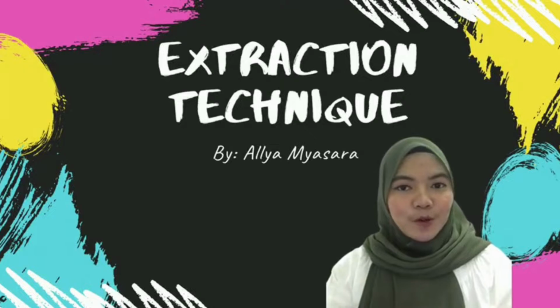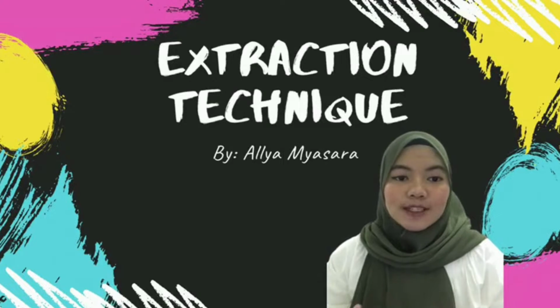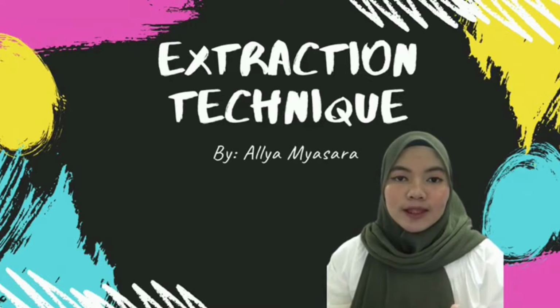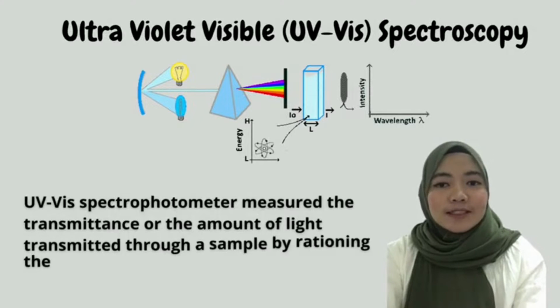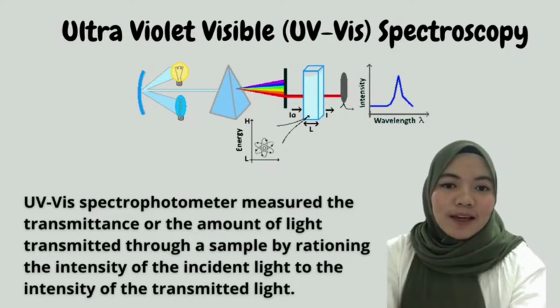I will continue with the extraction unit used to determine the concentration of bioactive compound in mango peel. So measurement of the phenolic compound can be either a quantitative method or a qualitative method. For this topic, we focus on the quantitative method, following the Folin-Ciocalteu method, using a UV Vis spectrophotometer. Ultraviolet visible or UV Vis spectroscopy is used to measure the transmittance, or the amount of light transmitted through a sample, by comparing the intensity of the incident light to the intensity of the transmitted light.